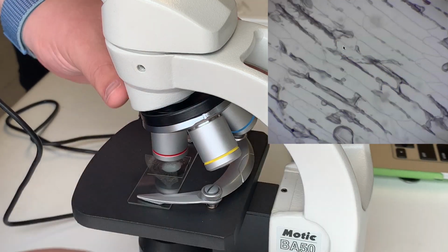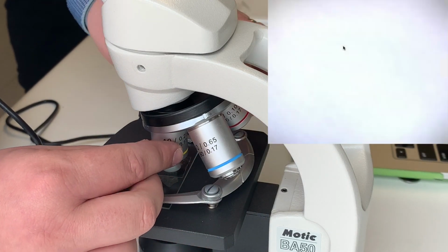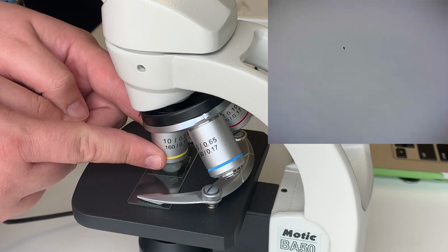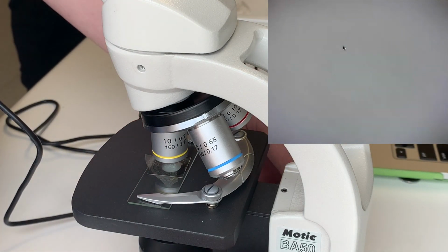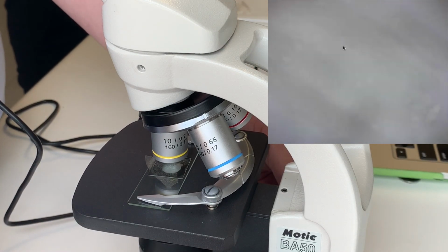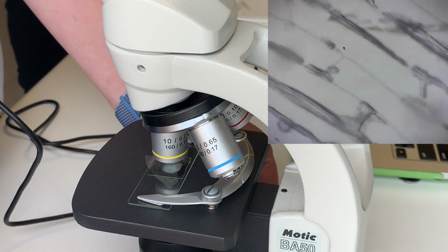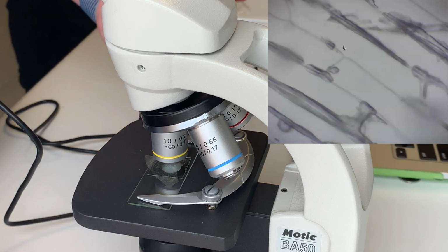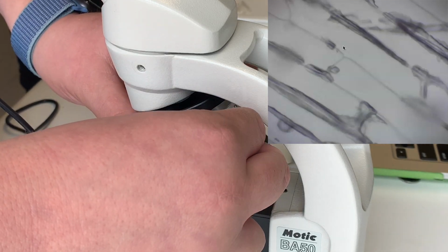We can then move the magnification up. So we're going to move to the next level of magnification. So we're now looking at 10 times magnification down here, another 10 magnification up here, so 100 times magnification total. Again, we start at the highest point and move the stage down until we get an image in focus, and then refine that with the fine focus. Again, not much more we can see, but we can see this in more detail now, and then we can see it obviously a lot larger.